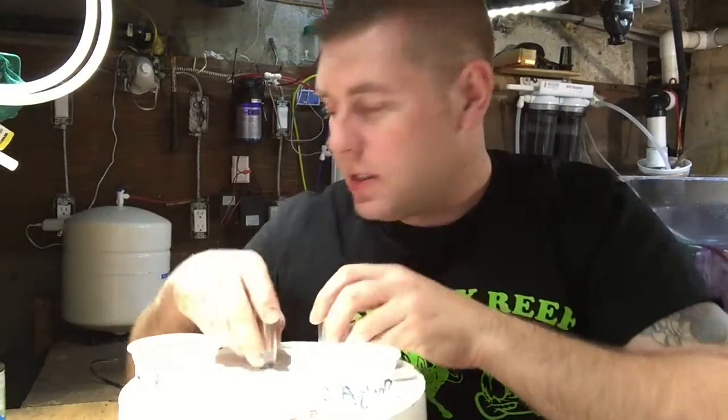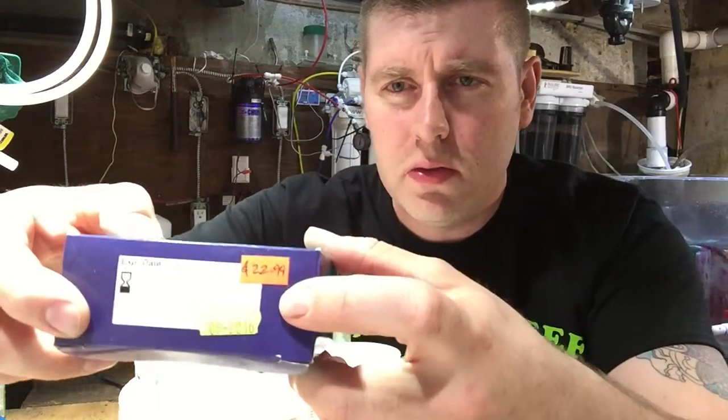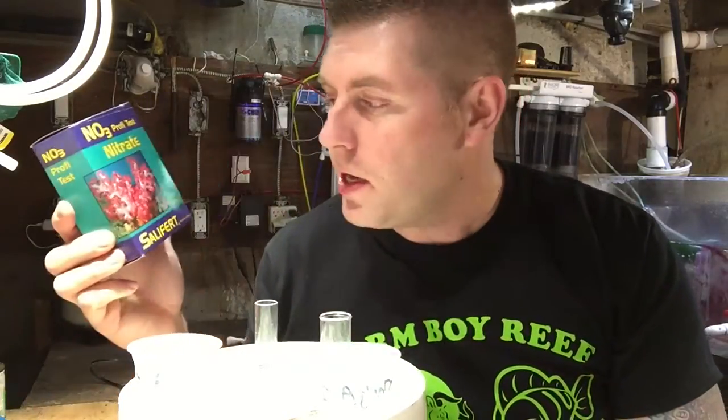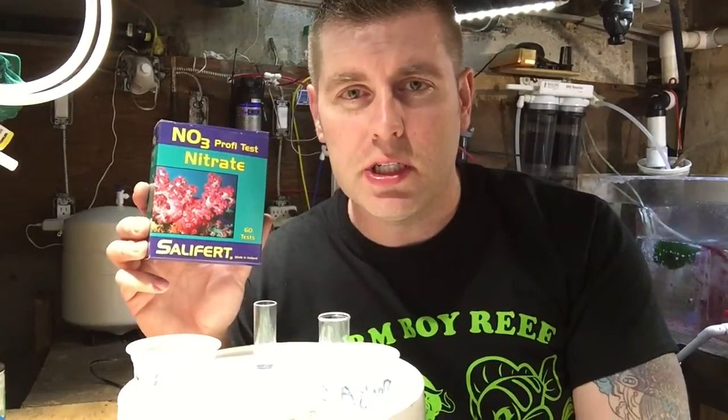That's the Salifert nitrate test. The kit cost me $22.99 at my local fish store — you could probably shop around and get a better deal, but that was pretty good. It's just three simple procedures. I love these test kits; they're so simple — no two vials, no waiting ten minutes. Just three minutes. It's one of the easiest and most accurate tests I've ever done and I've had great results.